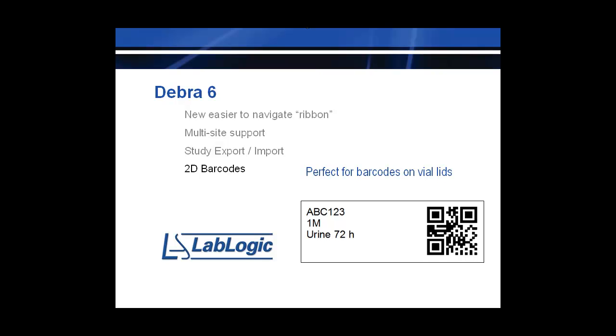Barcoding is increasingly being used in Debra. Now it is not only sample containers that have labels produced in Debra, but also cage cards, treatment analysis files, syringes and sample aliquot files can all have labels produced from Debra and unique barcodes included on the label. Due to the smaller size of aliquot labels, including both the barcode and human readable information has become harder, but when using 2D barcodes, a lot more data can be included within the barcode in a much smaller size label.